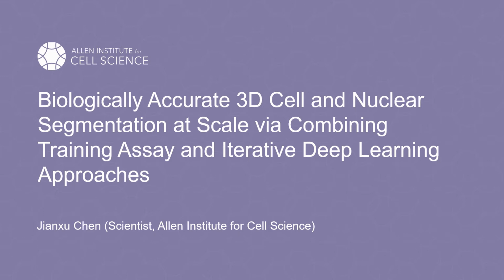Here I'm going to talk about the method and tools that we have developed at the Allen Institute to obtain biologically accurate 3D cell and nuclear segmentation at scale.